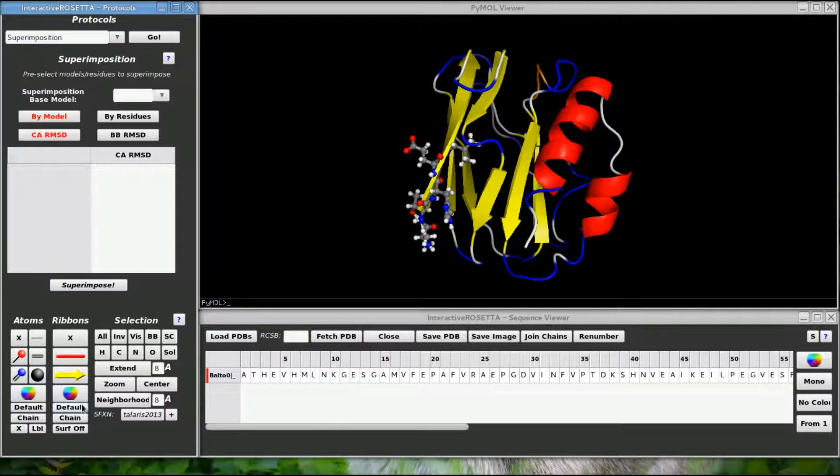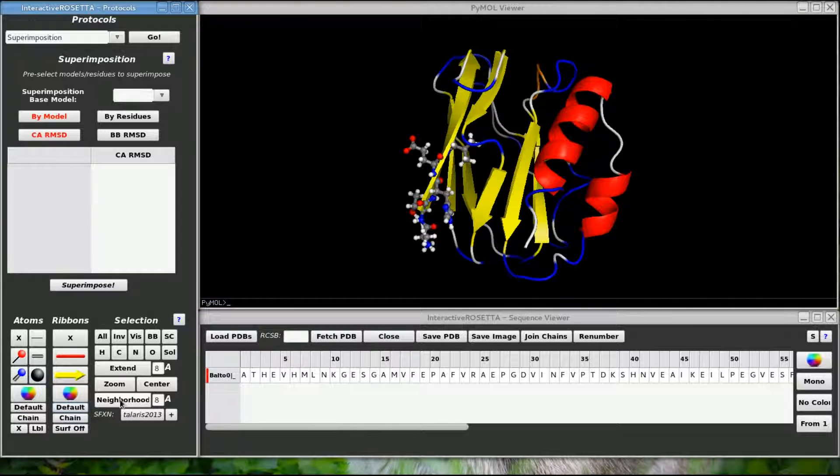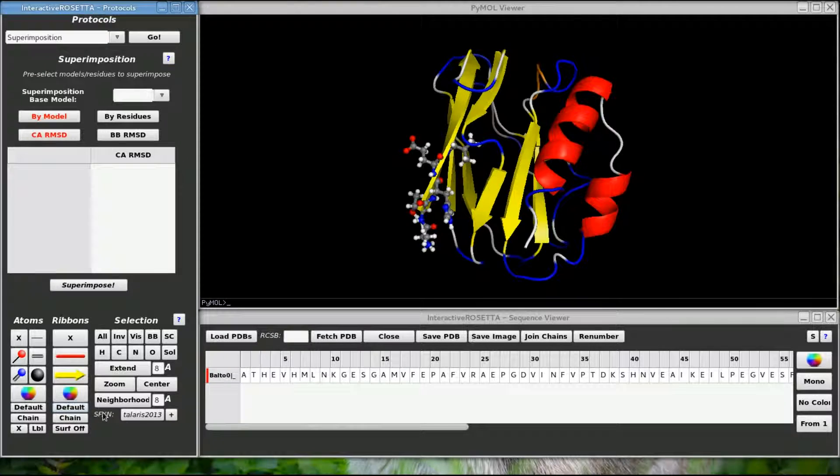You will notice that I did not have anything selected but yet the structure was still changing. If you use these buttons with nothing selected, Interactive Rosetta will apply the action to everything that is loaded.